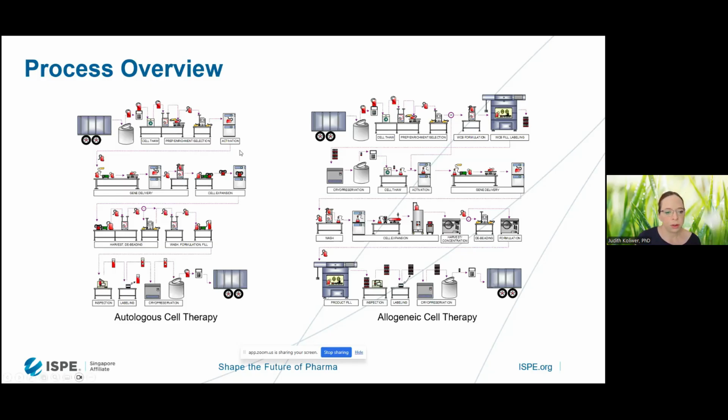And then afterwards, of course, our cell expansion, where now we have usually between 6 and 7 days. Maybe today we are getting into shorter cycles, where we are now expanding the cells as required, and of course analyzing what we have and if we have already reached the strength that we need in the end. Then afterwards we would harvest the cells that we need.